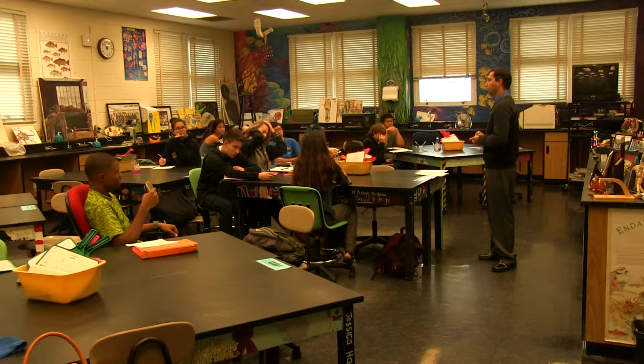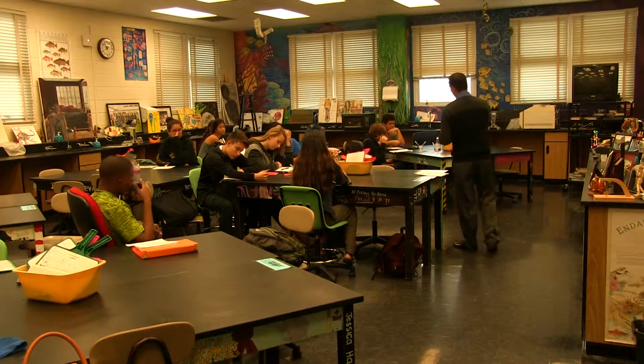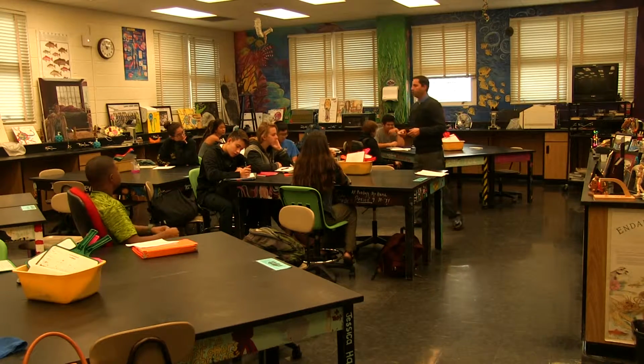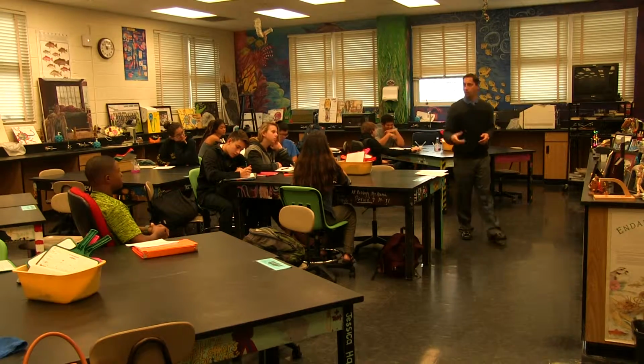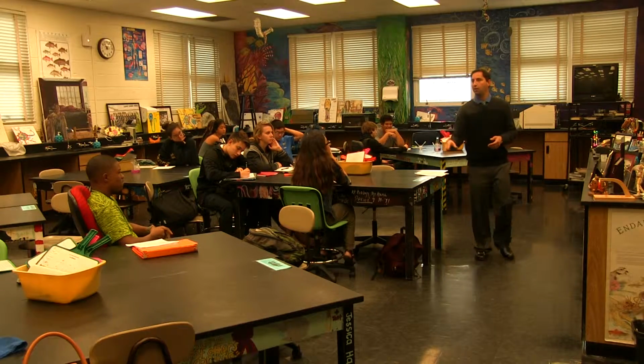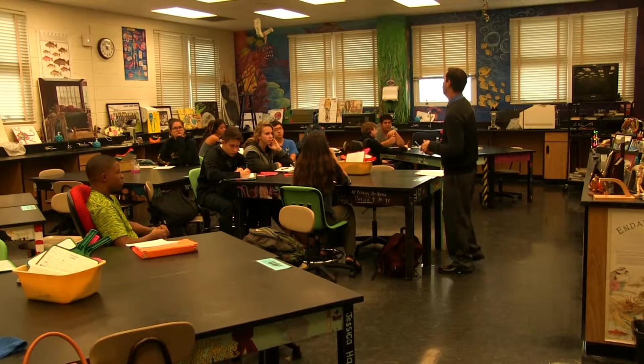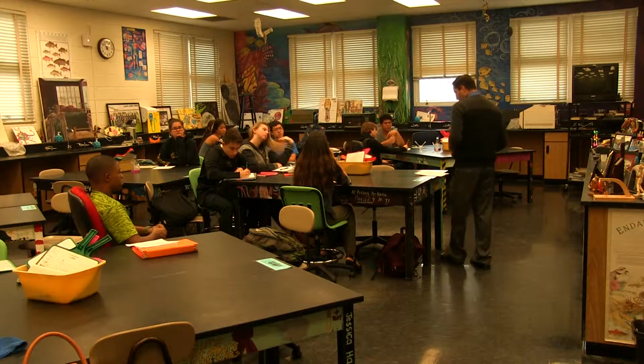Of course. Just like I showed you guys in the beginning, if I only blew in there for a few seconds, we wouldn't need too many drops to turn it back to the original color. If I blew in there for 30 seconds like some of you guys, I saw some of your counts, they were in the 80s, some of you guys had 100 drops and so on. That means there's way more carbon dioxide in there.